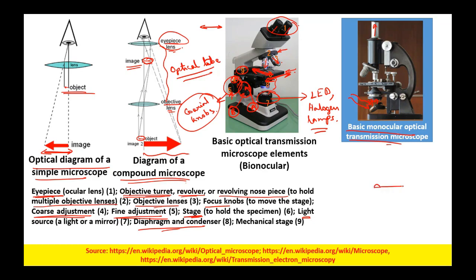So you have an LED light, you then attach a potentiometer, and you put it into an enclosure, and then you put a diffuser over here. You can attach it very easily, and you can upgrade your monocular optical microscopes into an electronic microscope. Further, we can attach some modular cameras in the eyepieces, and it can help us in converting both the binocular and the monocular microscopes into digital microscopes.